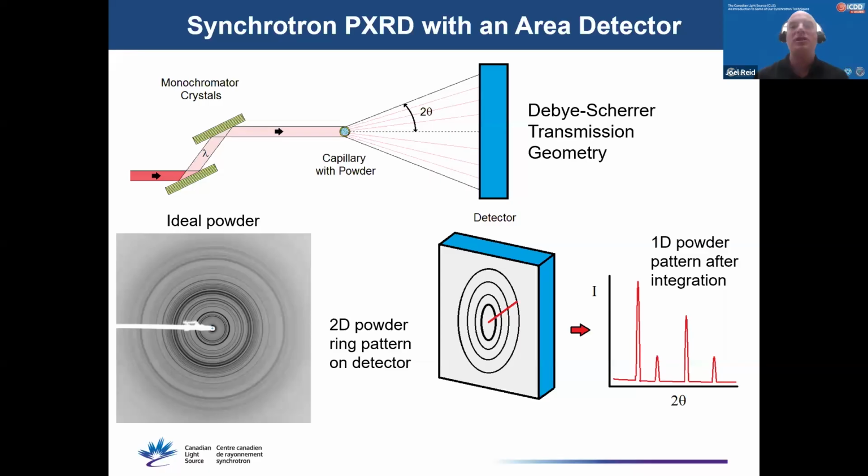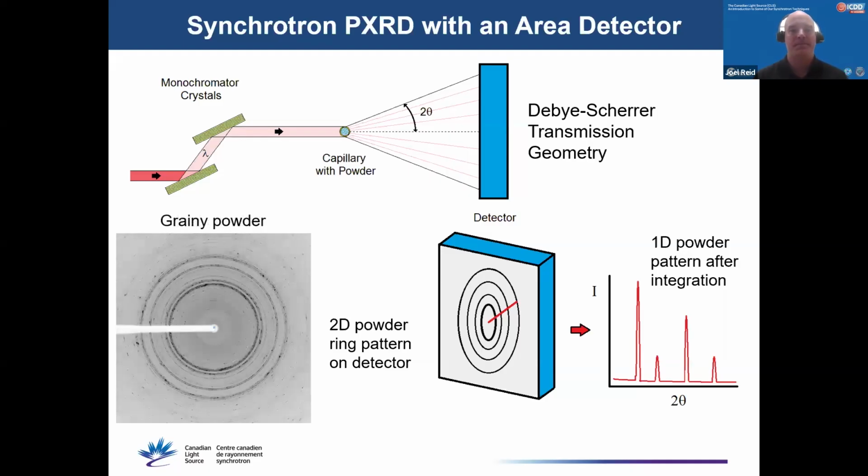This point about the 2D detectors is worth discussing in a little more detail. Samples from ideal powders with micron-sized crystals and no texture yield perfect diffraction rings, which are completely uniform. But often this isn't what we encounter from real samples, particularly with mineralogical samples. Real samples are often heterogeneous, multi-phase materials with a wide range of crystallite sizes, even when they've been extensively ground.